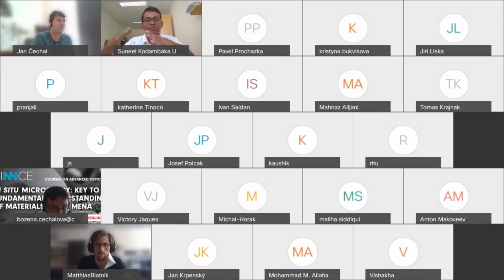But it so happens that you actually have two 1-1-1 planes at the interface. And so when you add oxygen, it changes its ability to wet the entire wire, and it just shifts to one side of the wire, which would be on the 1-1-0 plane. And so the interface changes. So it's somehow invisible inside the wires, right, at the interface. Okay, so then you just make this motion go in a different direction.